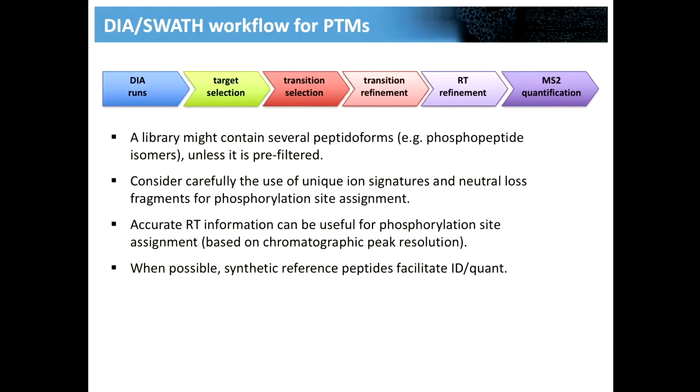This is not the case for every phosphorylated peptide, and I cannot tell you a lot about other modifications, but we certainly see that phosphorylated peptides that are modified on different residues will have shifts in retention times, and this information can be incorporated into your library and can be very, very useful.